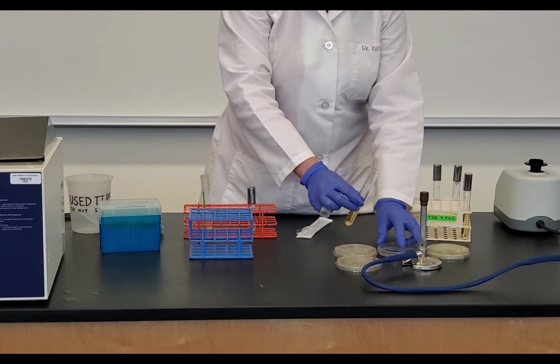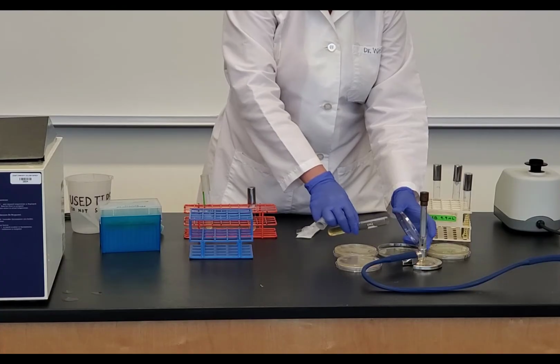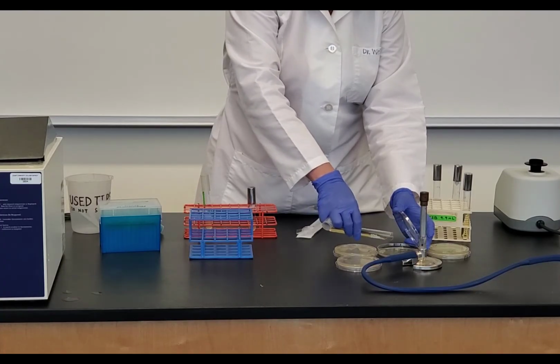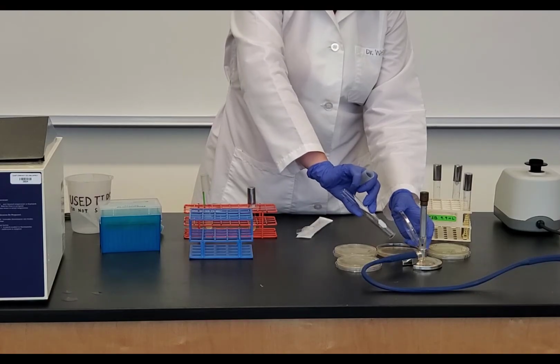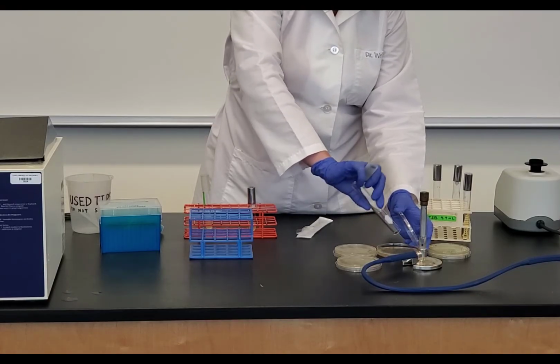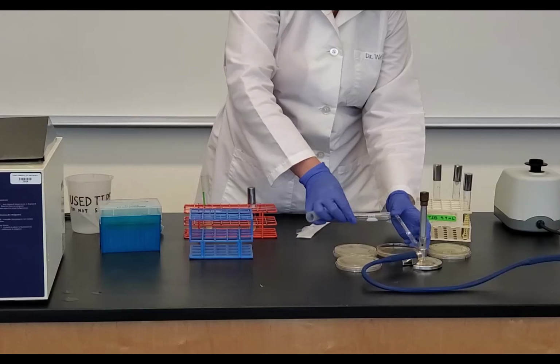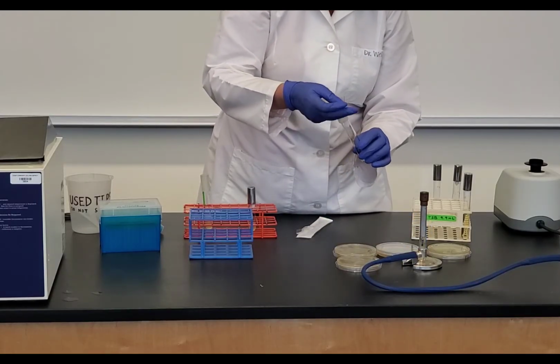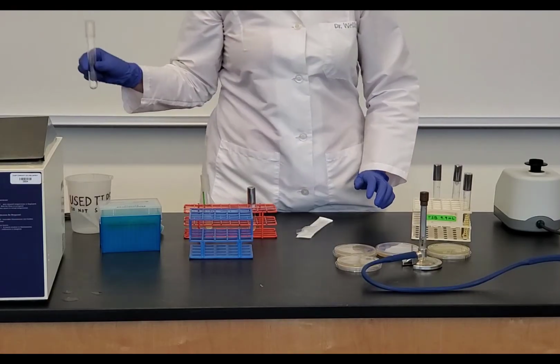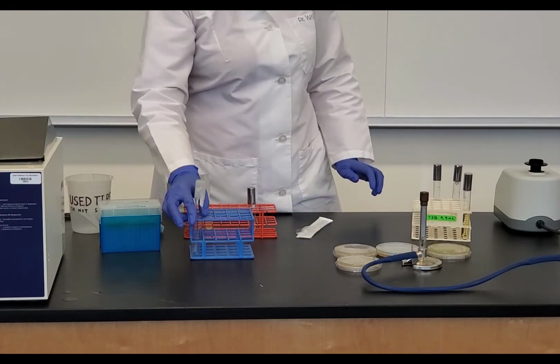So I just let it sit for a minute, and then I'm going to pour carefully over the agar and try to get all of the agar out of that tube. Okay, and then I'm going to recap this. And now I'm done with this tube. So I can put that aside.